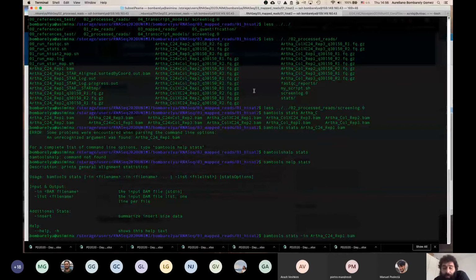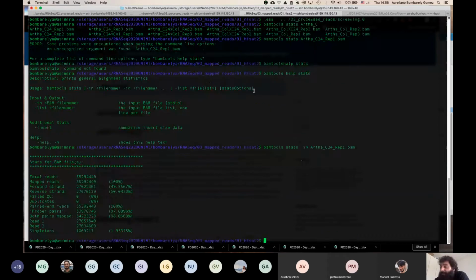So one thing that happens in bioinformatics is when you run programs, you will need to wait. So another skill that you develop is to do things in these intervals. So sometimes, yeah, you are running 2 or 3 or 4 things at the same time.